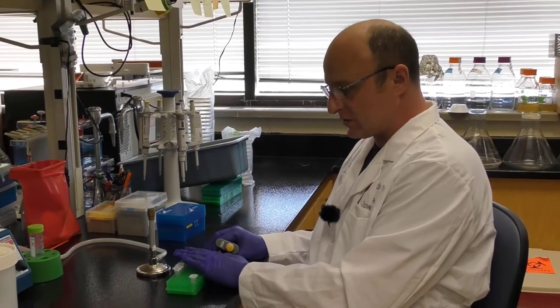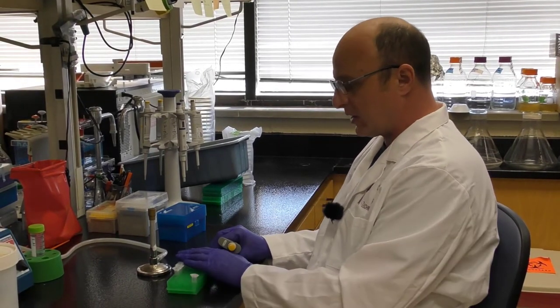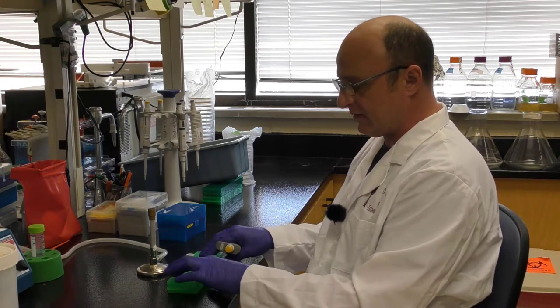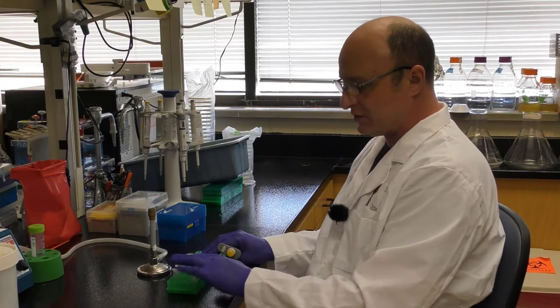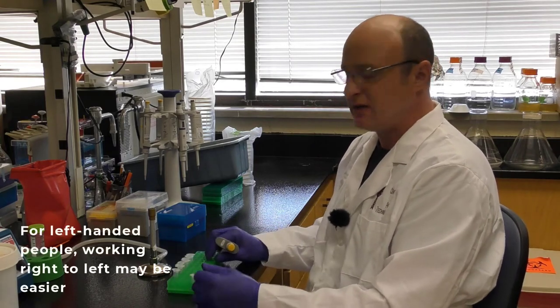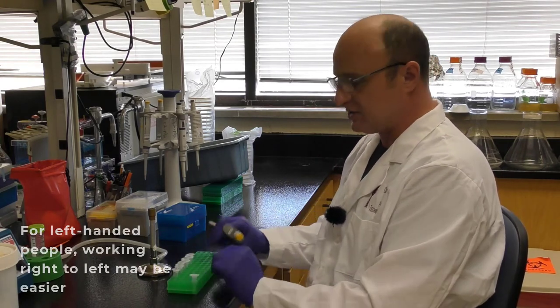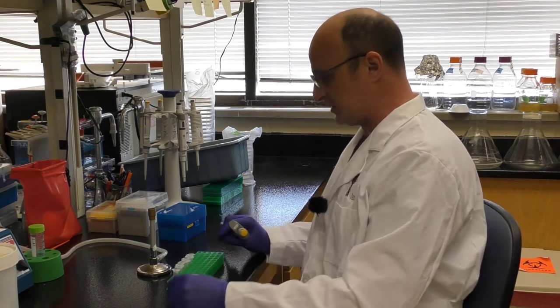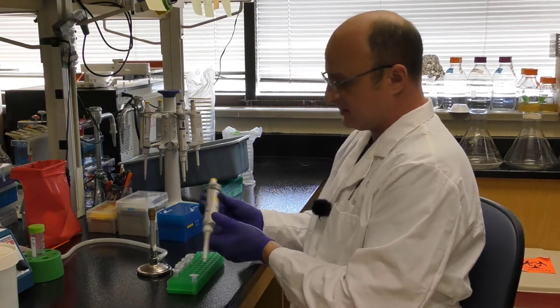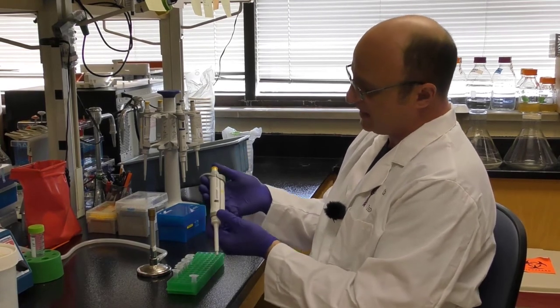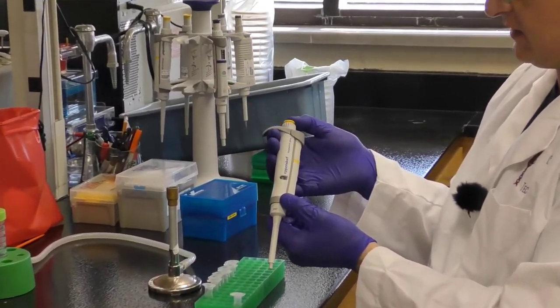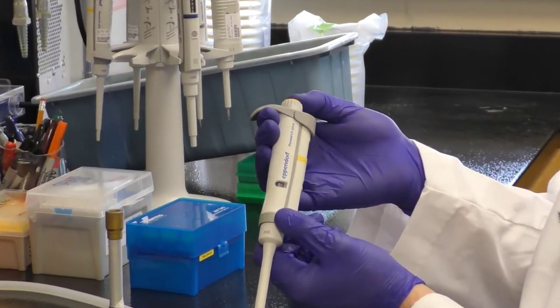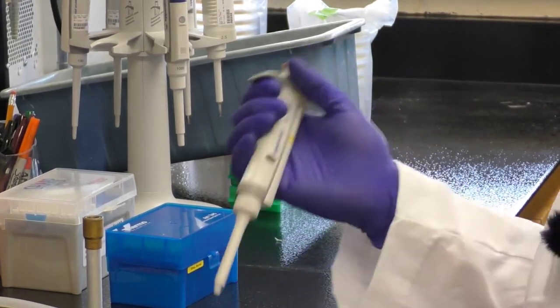We have our aliquots ready, we have our phage sample ready to go. What I like to do is I keep all my tubes together but I have a little space to the left. So as I complete each serial dilution I will move the tube over to the left, that means I'm always clear where I am if I ever get distracted. I have my pipette set to 100 microliters and as always we make sure that we know the two shoulders. There's the first shoulder where that's the correct volume and then the push through is just ejection.